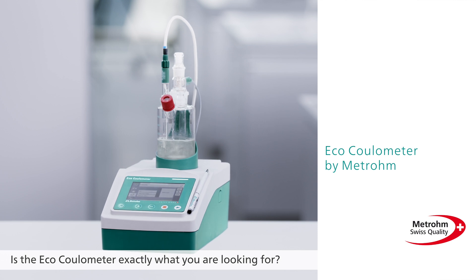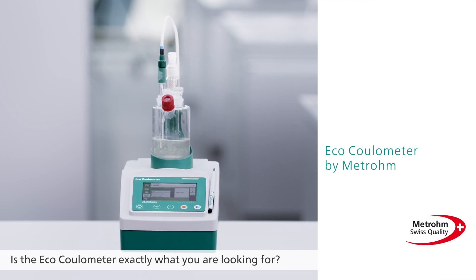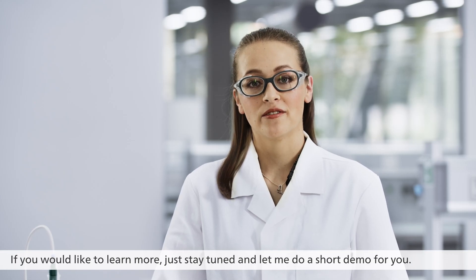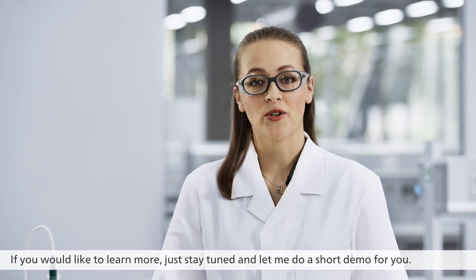Is the Eco Coulometer exactly what you are looking for? Then ask your Metrohm sales rep for a quotation now. If you would like to learn more, just stay tuned and let me do a short demo for you.